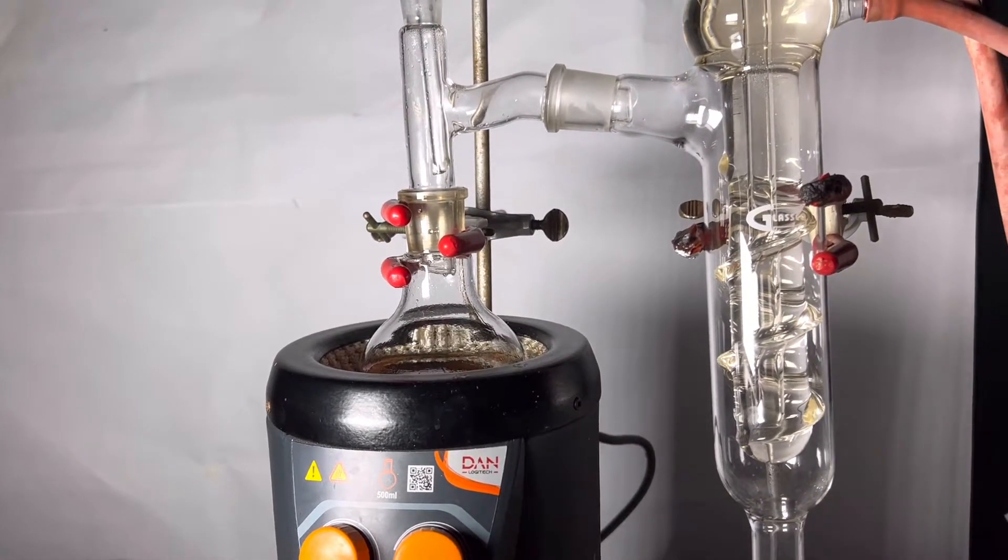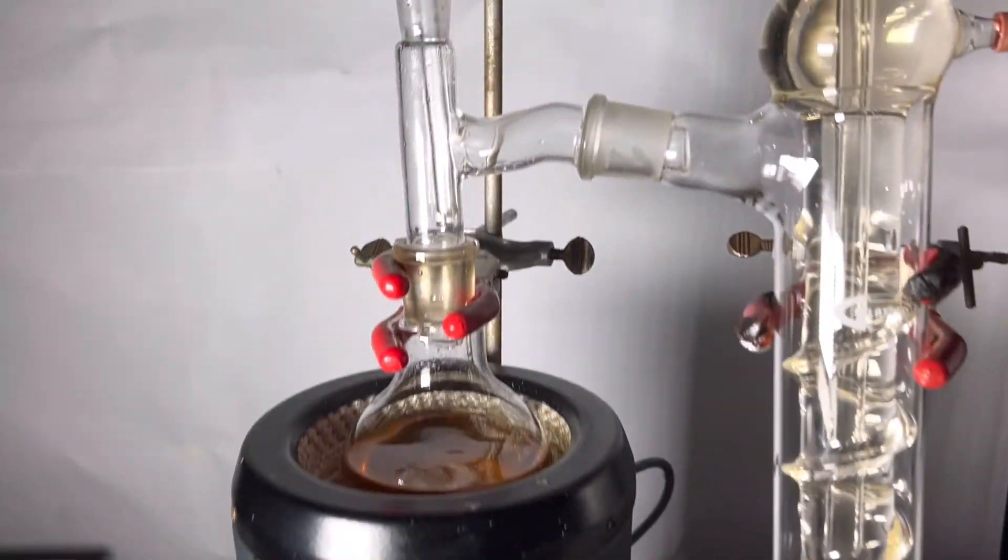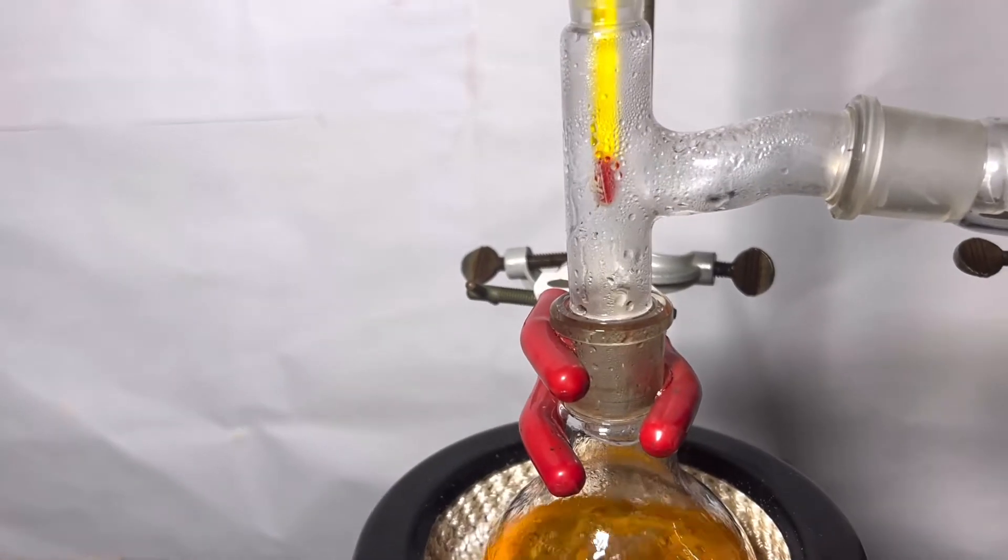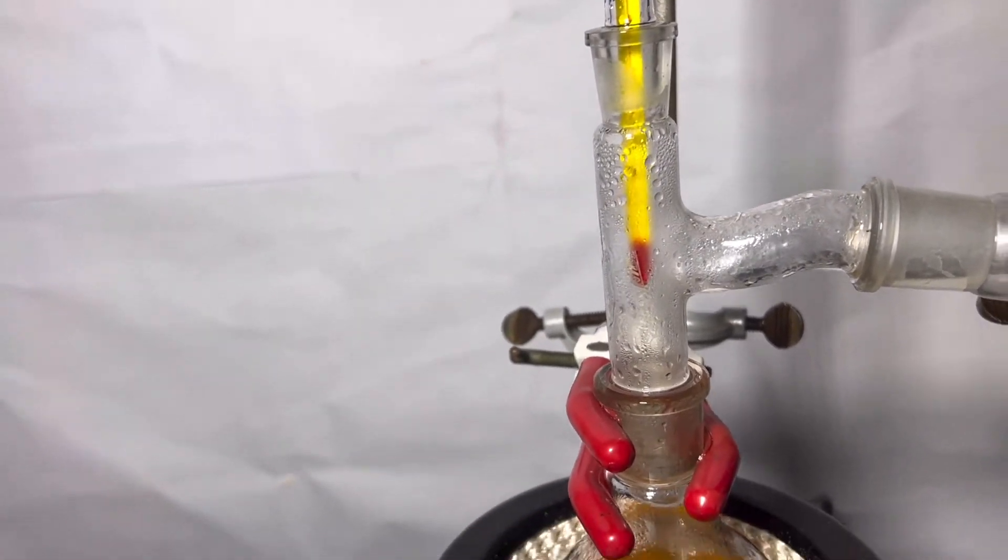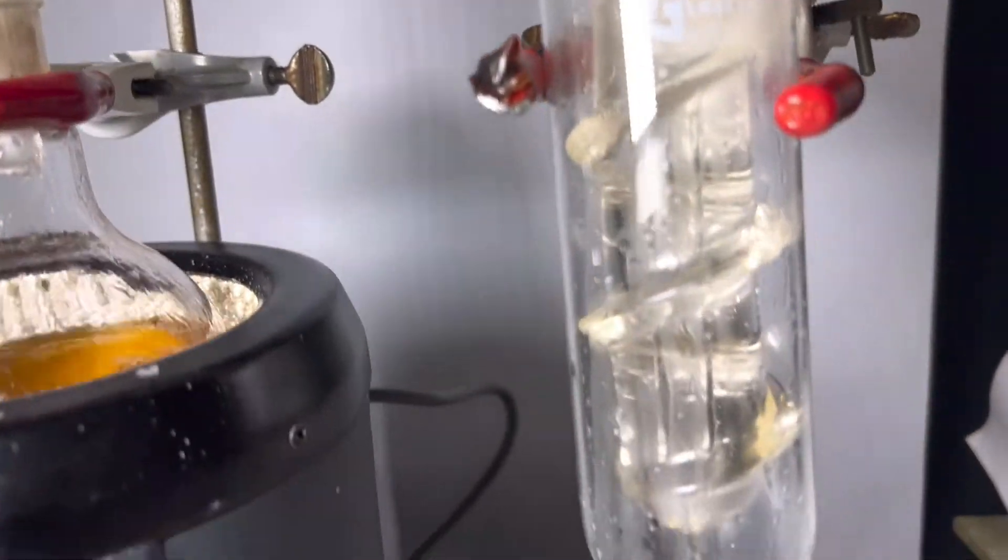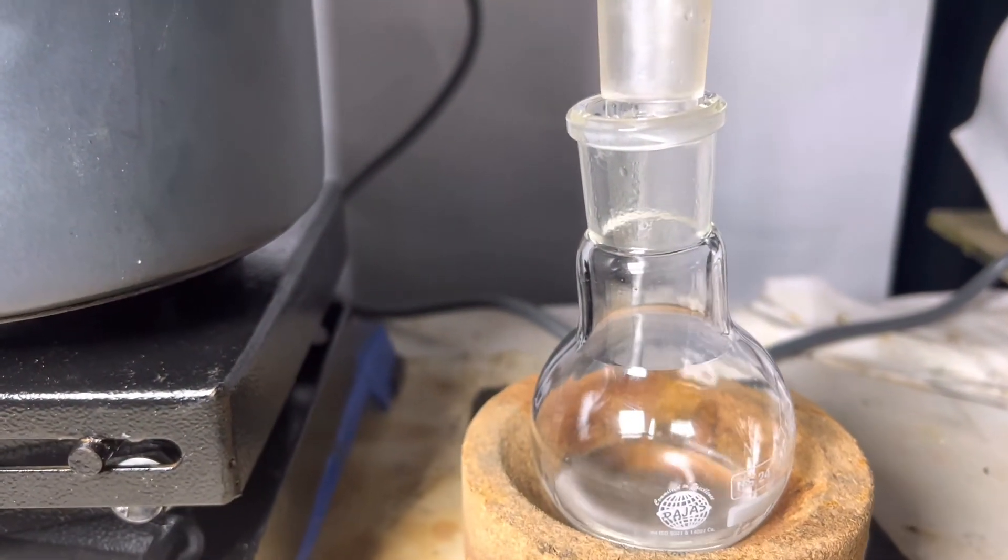Valeronitrile distills over with water. We can clearly see as the oily droplets pass over the distillation. By about 20 minutes almost all of the valeronitrile distills over.